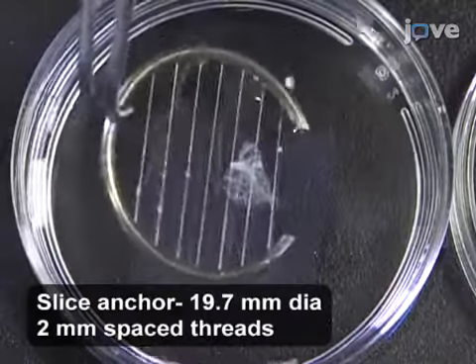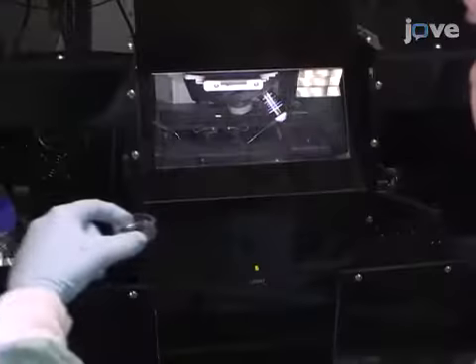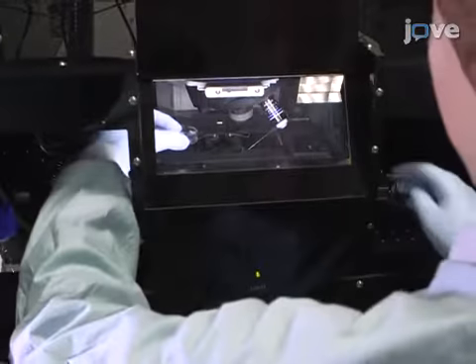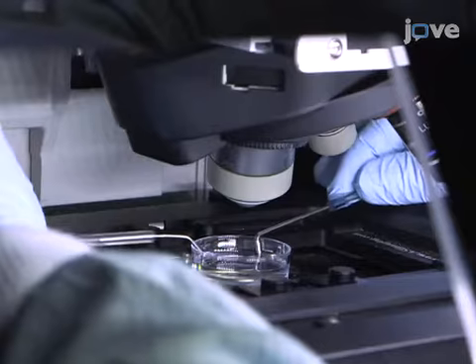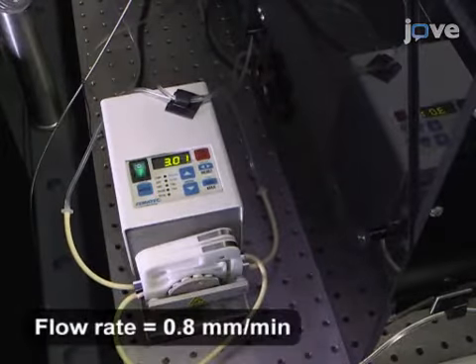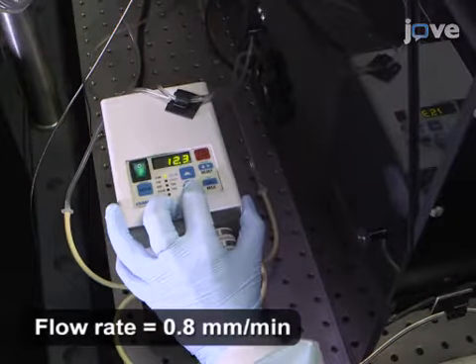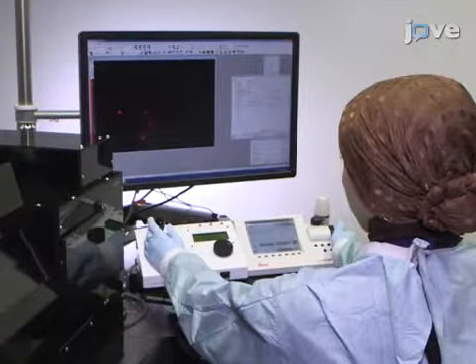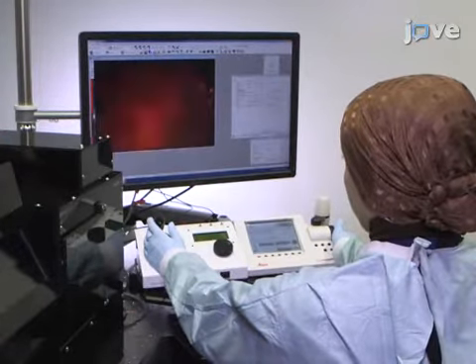Then place a slice anchor over the slice to support it. Next, place this petri dish on the imaging stage of the microscope. After connecting the inlet and outlet tips of the perfusion system, turn on the peristaltic pump to allow the oxygenated medium to go through the perfusion tubes. Lower the water immersion objective to the slice and focus on the top of the slice with bright field light or with the appropriate wavelength.